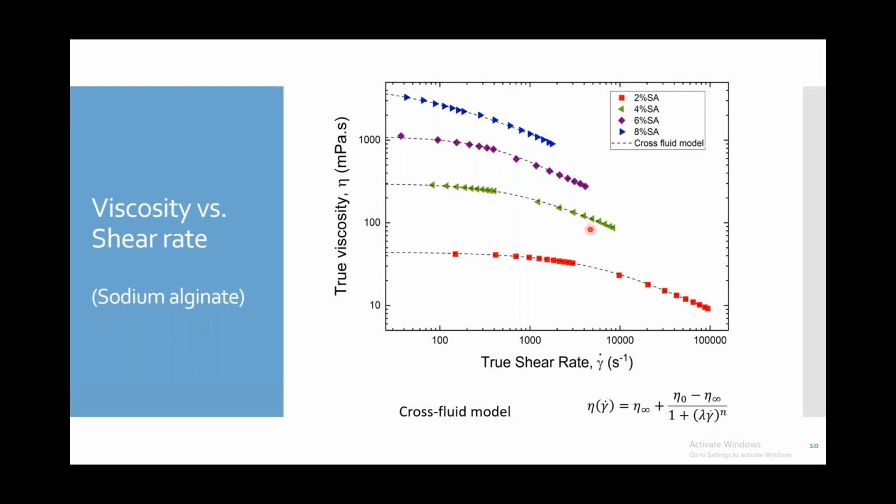in extrusion bioprinting. Since our samples exhibit non-Newtonian behavior, WRM correction was used to determine the true shear rate and true viscosity. It's been reported in the literature that when we use high viscosity shear thinning materials, increasing the polymer concentration can increase the printed resolution, and it shows better shape retention after it's printed.